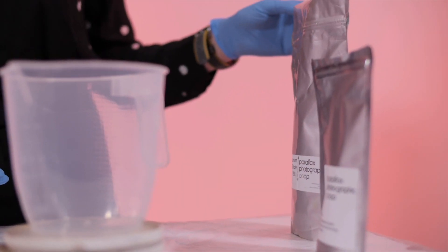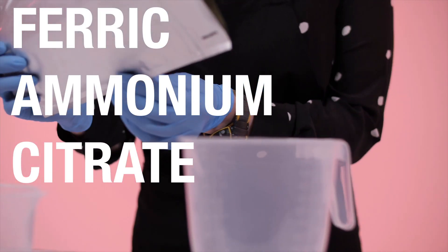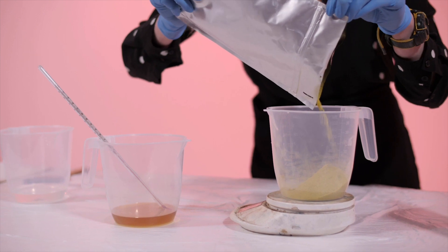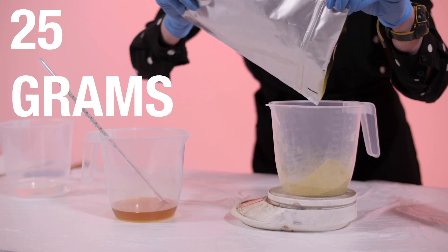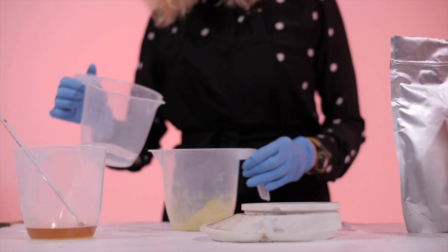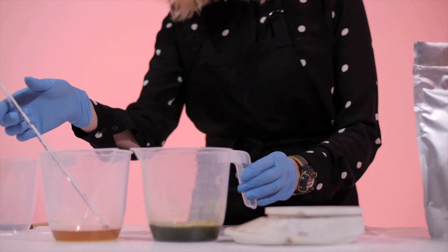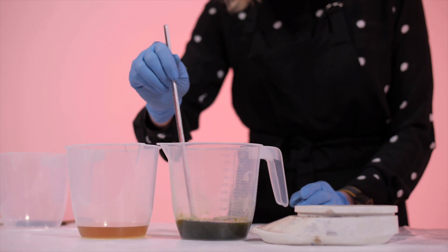We are now measuring out the ferric ammonium citrate. This is a very bright yellow colour. We are measuring out 25 grams of ferric ammonium citrate, then mix in another 100 millilitres of water until we have a kind of greeny blue liquid. Make sure to dissolve the powder really well.